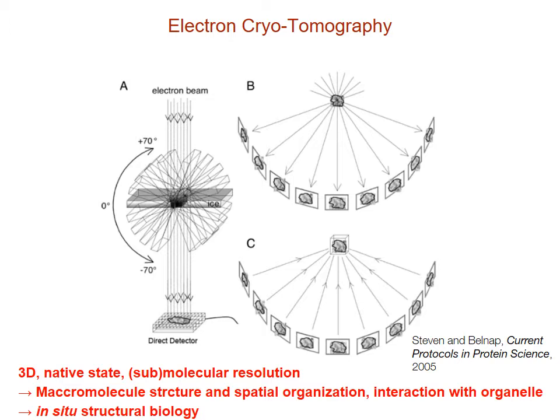Therefore, this reconstructed 3D image contains both macromolecular structure and spatial organization and their interaction with other cell organelles. And this method has become a very promising technique to study structural biology in situ.